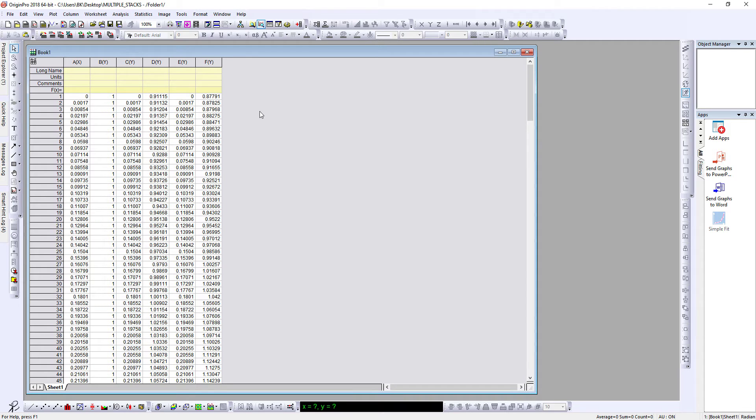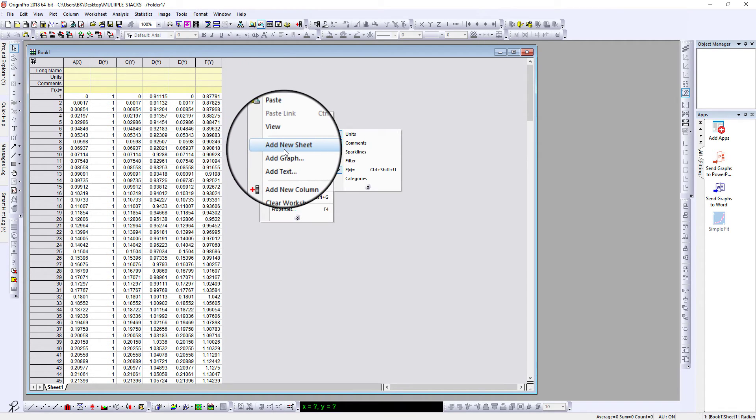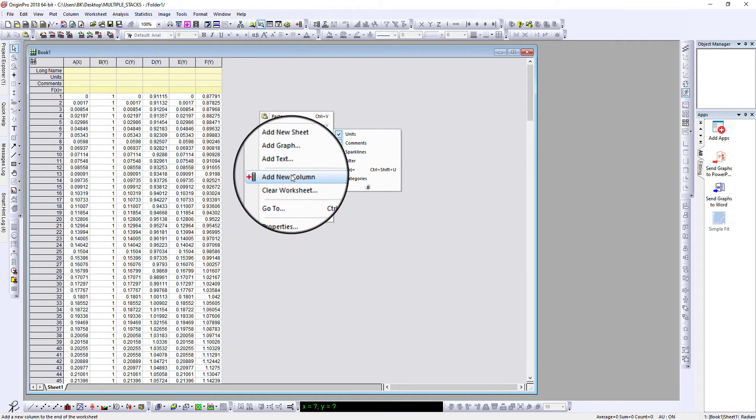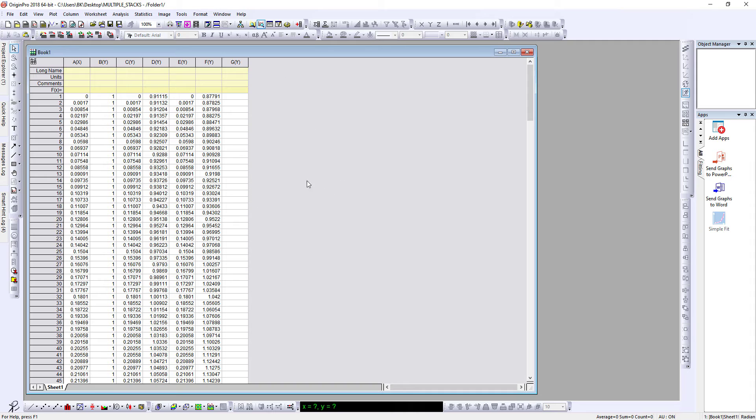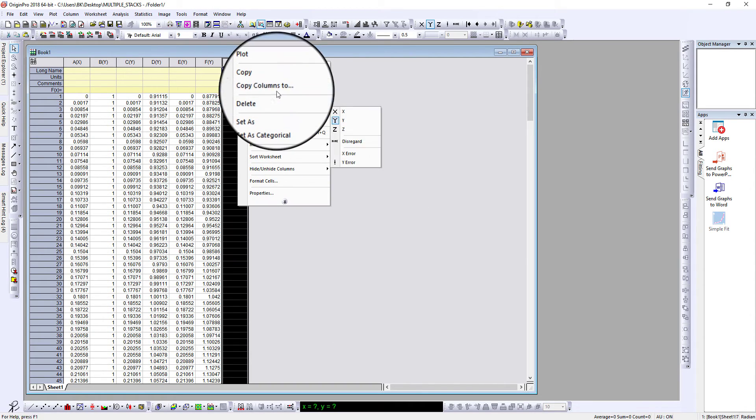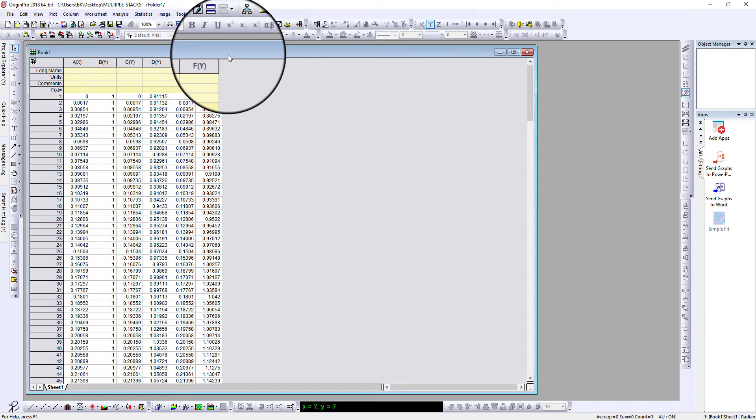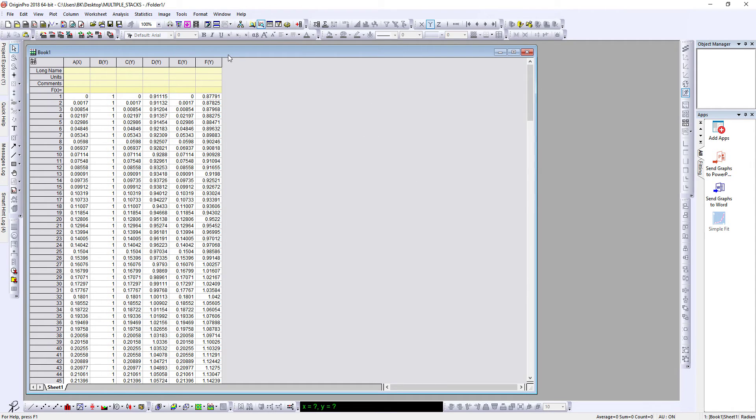Just right click on the empty space and click on add new column and the column will be added. To delete it, just click on it, right click, delete. This is how you add or remove a column.